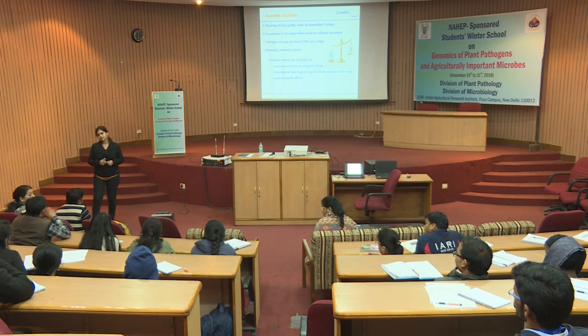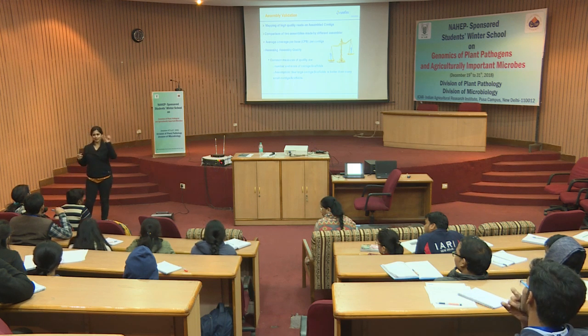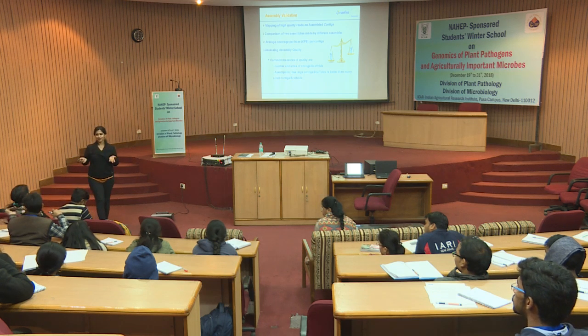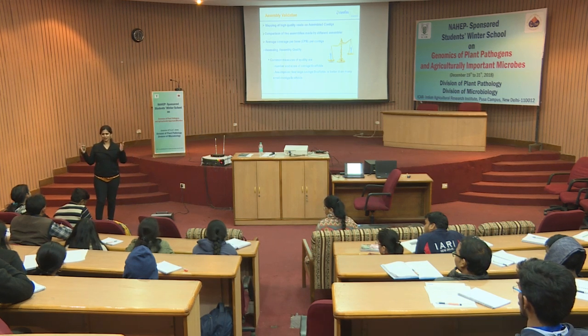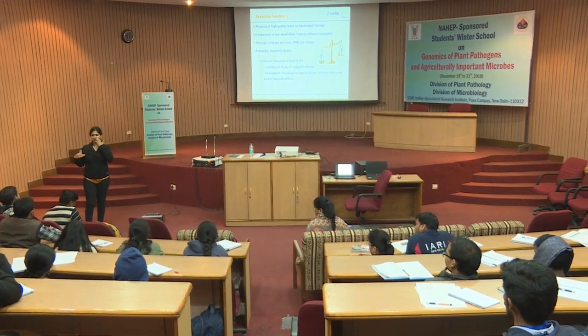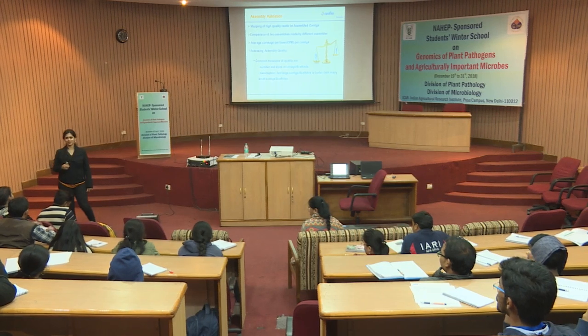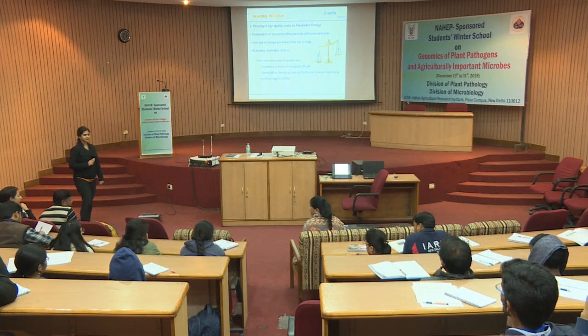In Illumina it does not slip. The technology is different, right? Short reads. It has an adapter and the adapter is getting sequenced. So, there is a DNA template which is getting sequenced. It is not a polymerase binding, where one base is getting sequenced, right. So, the sequencing chemistry itself is very different. It is sequencing by synthesis chemistry in Illumina, right. There is a shorter library, and sequencing is based on DNA templates. It is a bridge amplification. You can just go through bridge amplification, you will understand what is the difference between both. Yeah. So basically one is through sequencing.